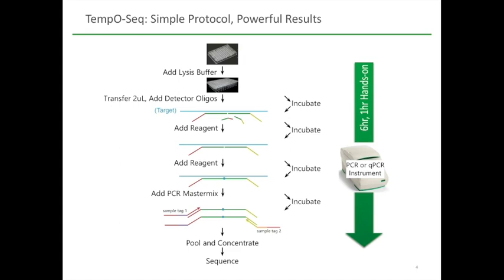The specificity is driven based on the requirement that 2 oligos hybridize immediately adjacent to each other in order to be ligated in this step. Furthermore, background signal is reduced in this step by addition of a reagent that reduces the complexity and knocks down that potential off-target hybridization.